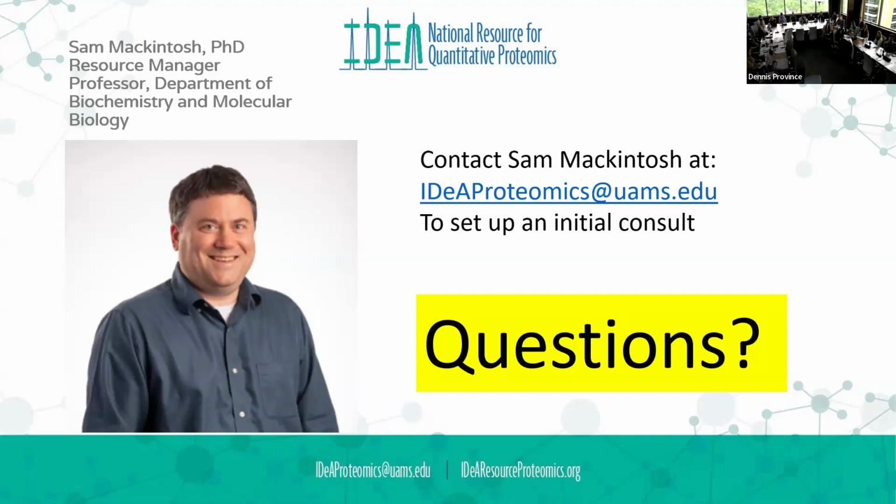We can come back and do what we call a semi-tryptic search, where we look for some of that. So it's feasible, but you need a supercomputer for that. You're going to end up getting a lot of information that you have to sort through.